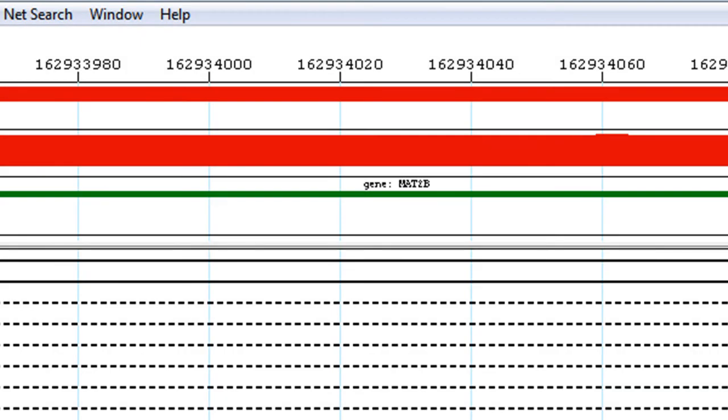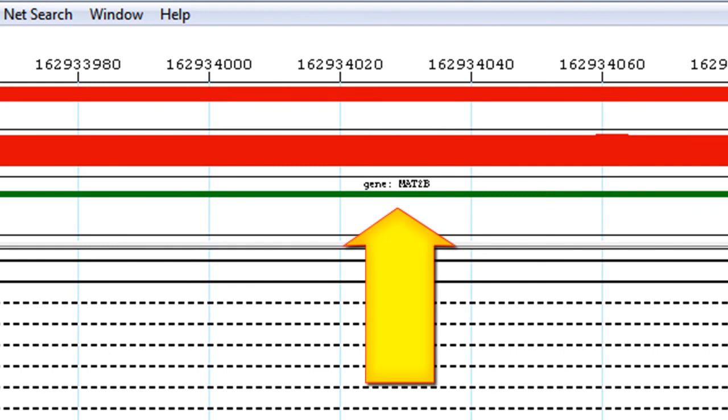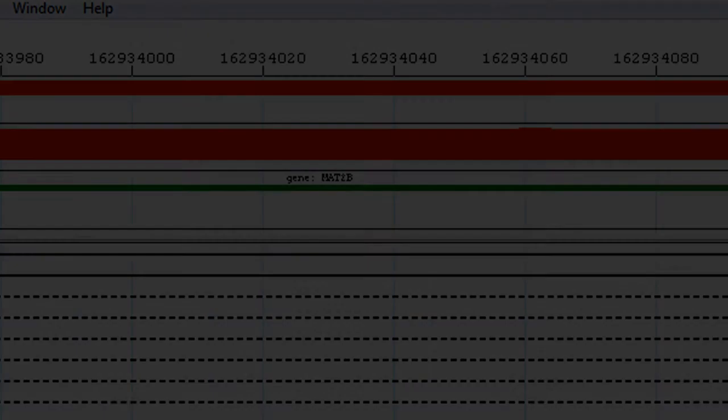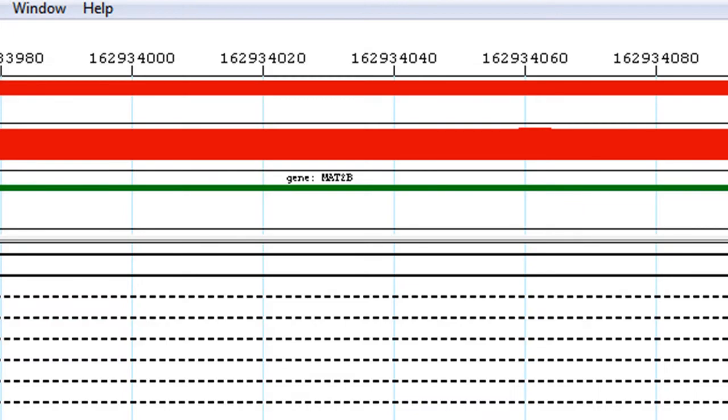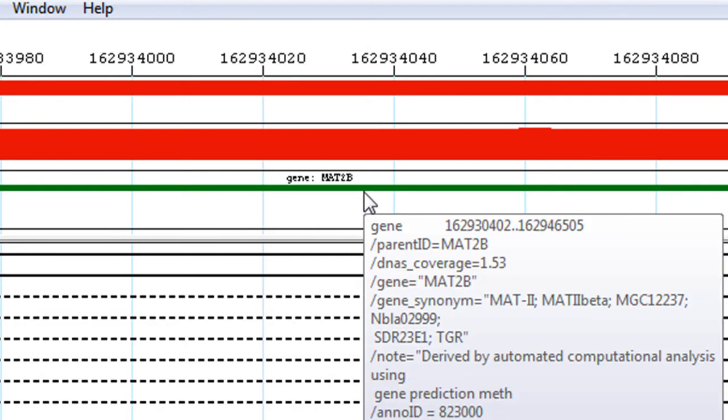Even more importantly, we can see the location of the viral integration site. In this case, it is located inside of the MAT2B gene. We can get more information about the gene by hovering over the feature.